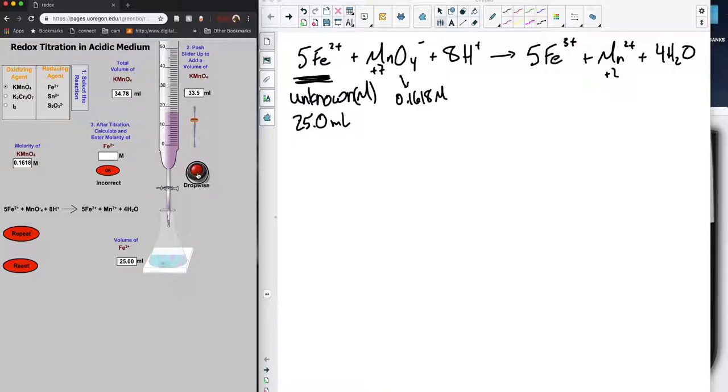What you'll notice in the lab is that you will grow impatient with this, but the main thing is to stay calm and make sure that you're paying close attention to the water, so that way you know when it's going to turn pink. That way you'll have less human error and you'll be able to decide what the proper concentration is. So again, fast forward.